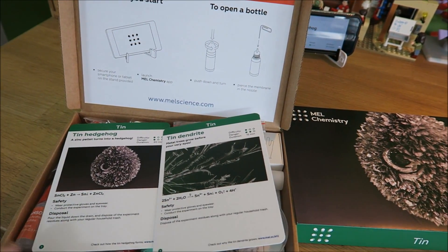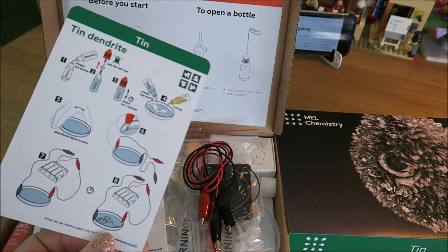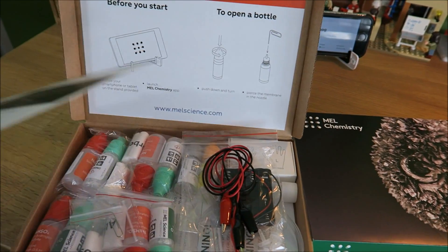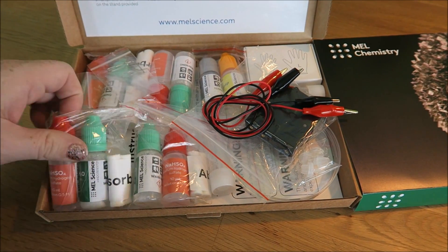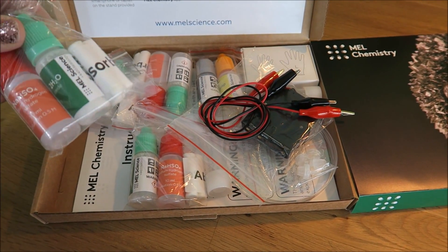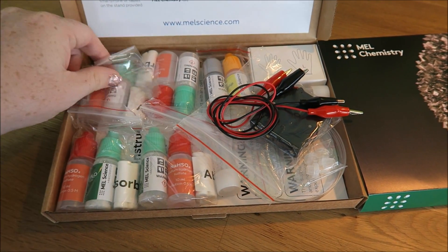Here is the box with our nice little instructions and all the bits you get inside. We have little packets so that's everything you need for one experiment.